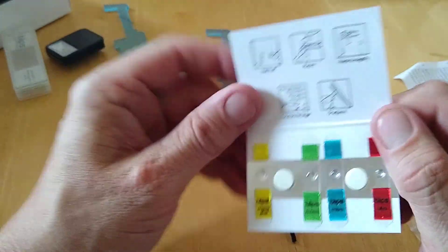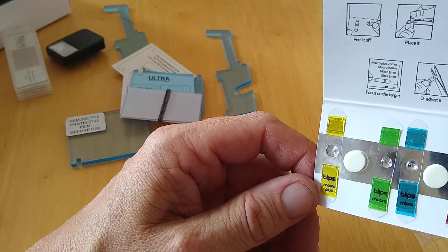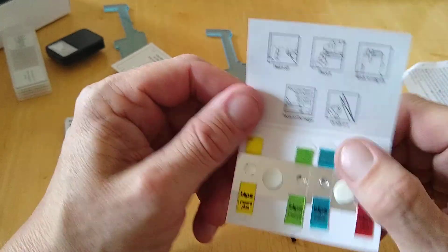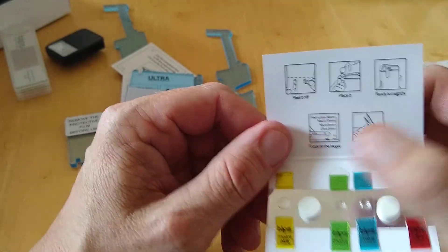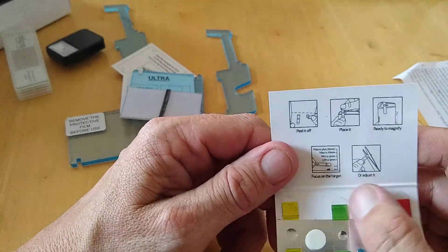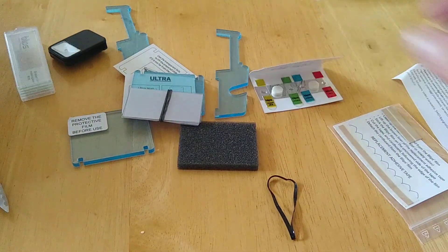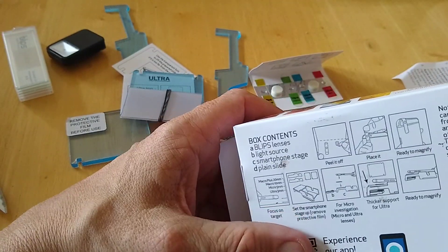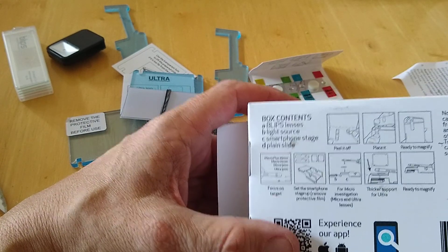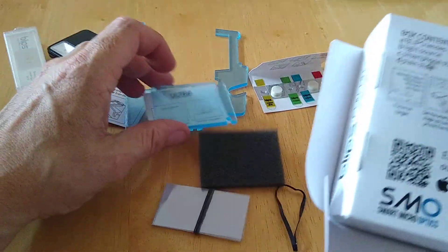Some more pieces of transparent plastic here, and this will be our light source. We can see we've got blue macro, red, and green. It tells us what we need to do: peel it off, place it, ready to magnify, focus on target, and adjust. On the back it tells us how to put it together as well — it seems pretty straightforward.